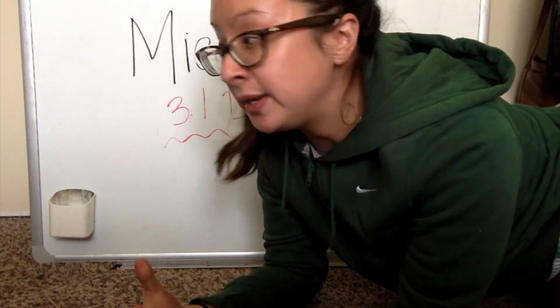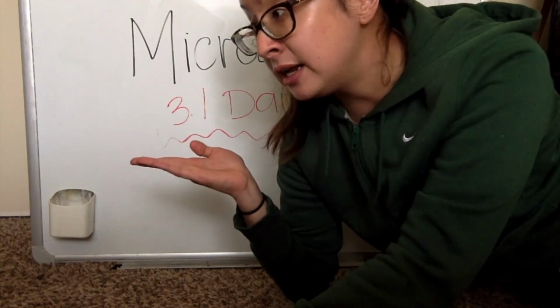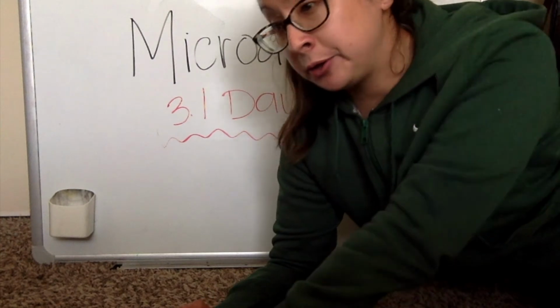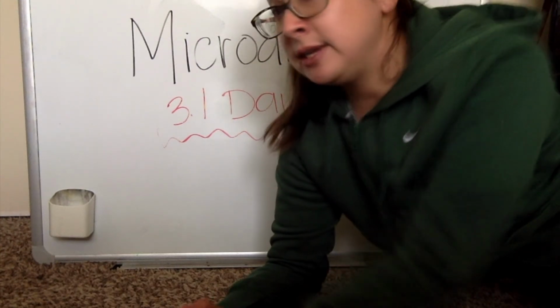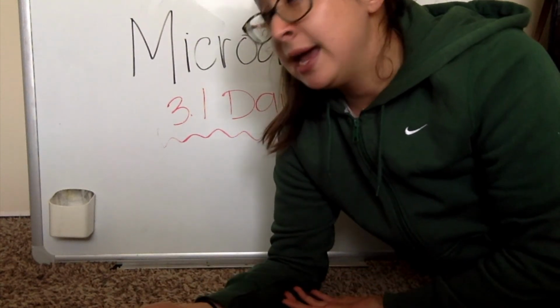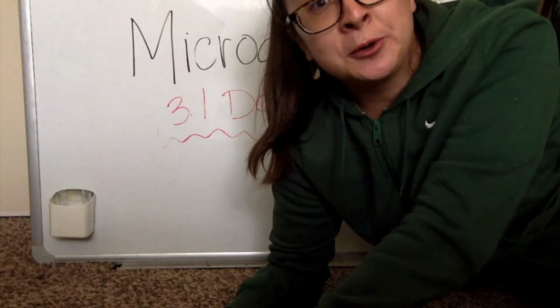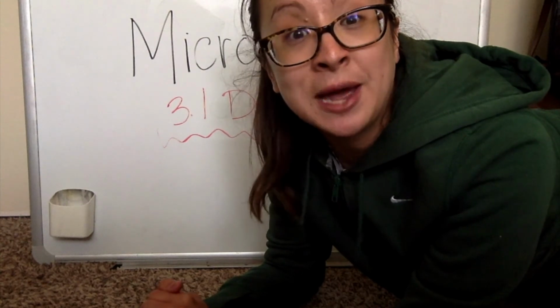So in this week, you're going to learn more about the science behind microarray technology. You will perform your own simulated DNA microarray experiment to study the expression in healthy lung tissue and in cancerous lung tissue, and then you should be able to analyze DNA microarray results, which was a lab we would have done in class if we had school.